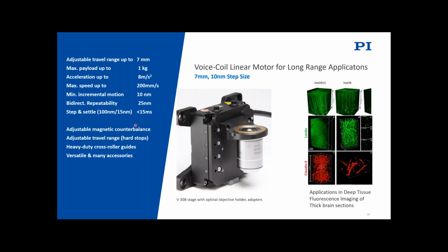So it's more of a frictionless platform. This usually has the drawback of not being very good for operating in a vertical orientation. But here we've introduced a magnetic counterbalance that can basically compensate for loads up to 1 kilogram.